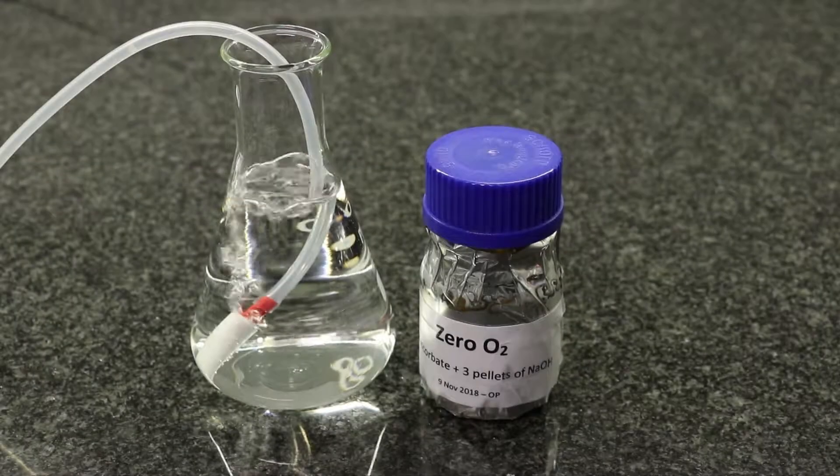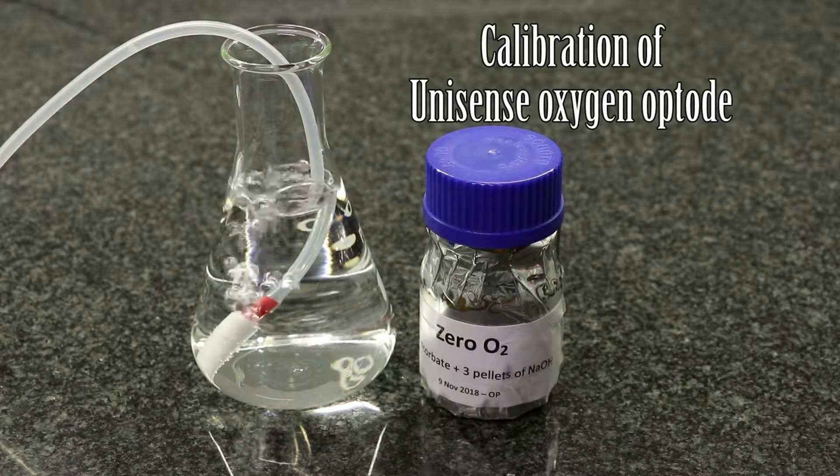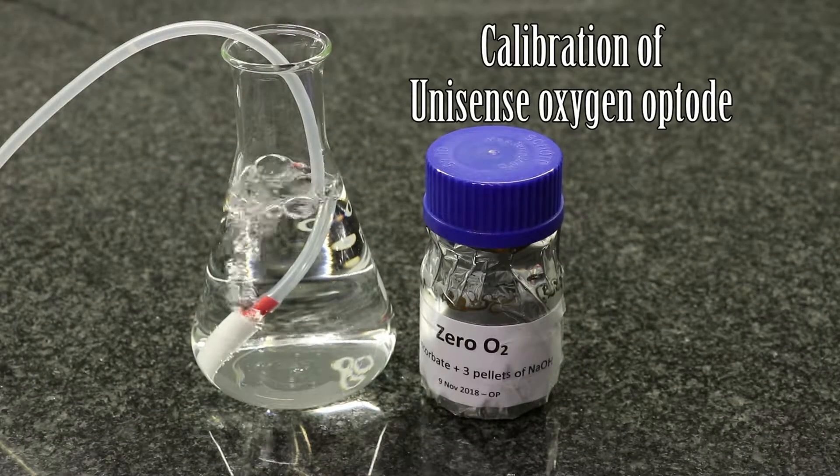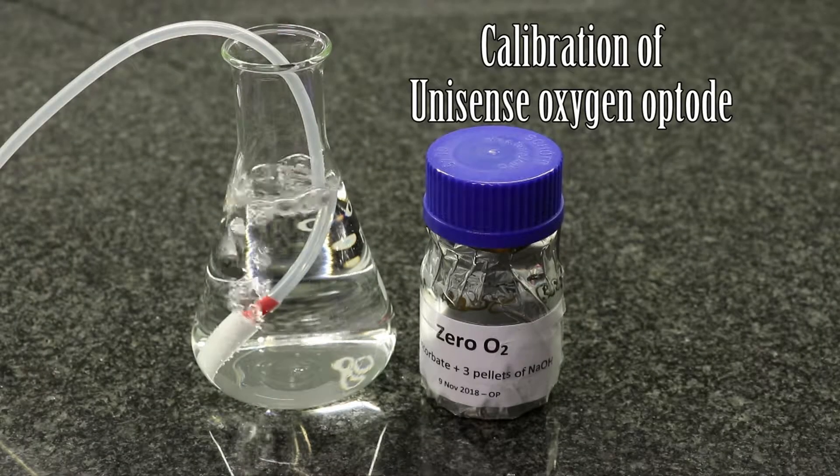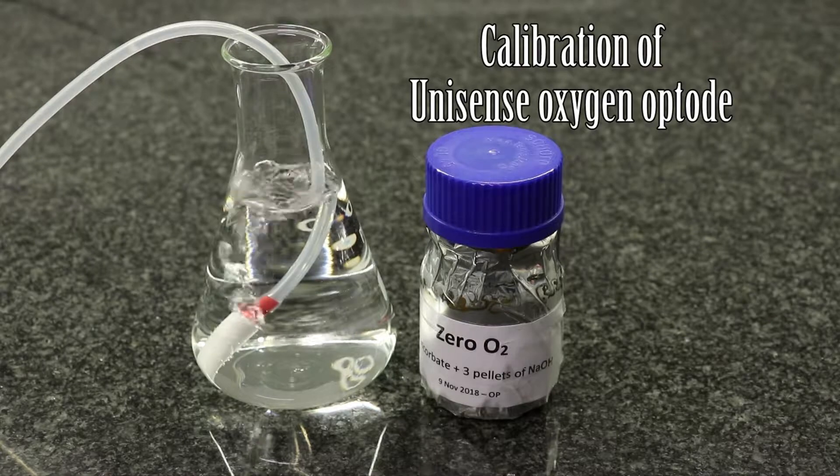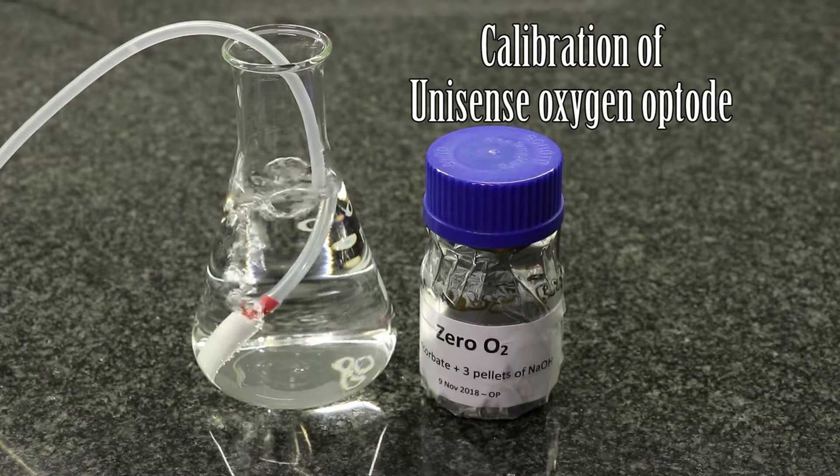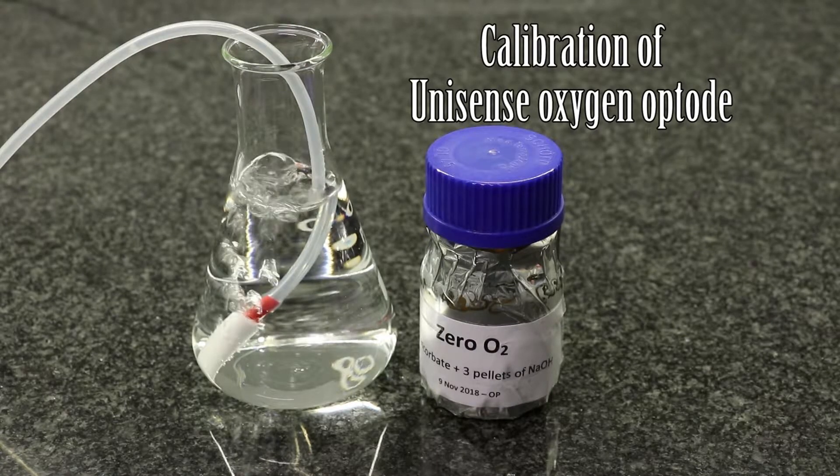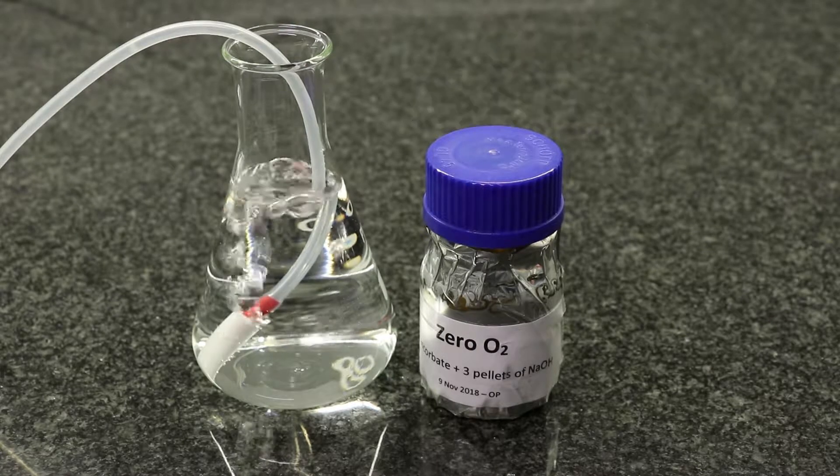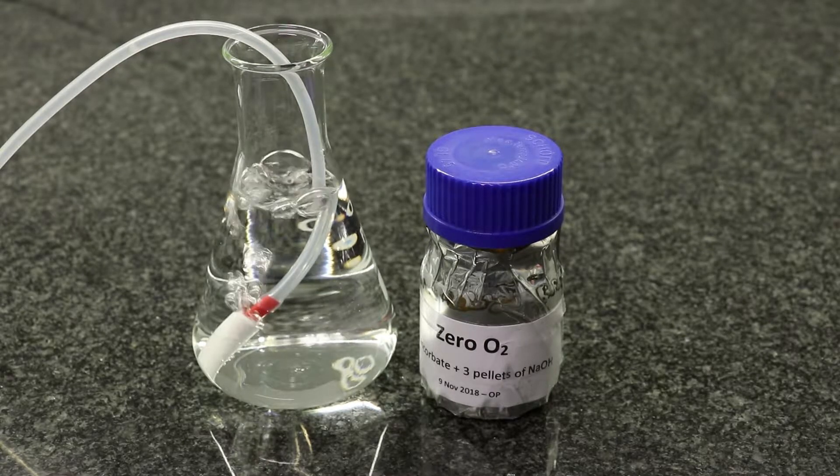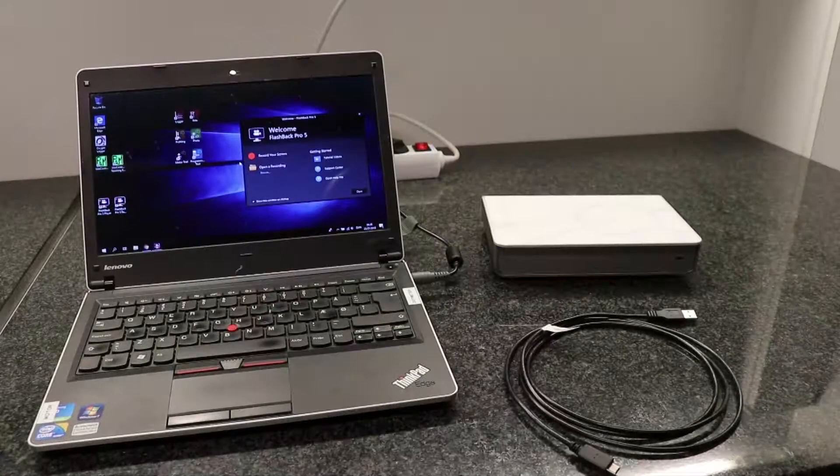For calibration you need aerated water and a zero solution, both have to be at near room temperature or the temperature you want to do your measurements in.